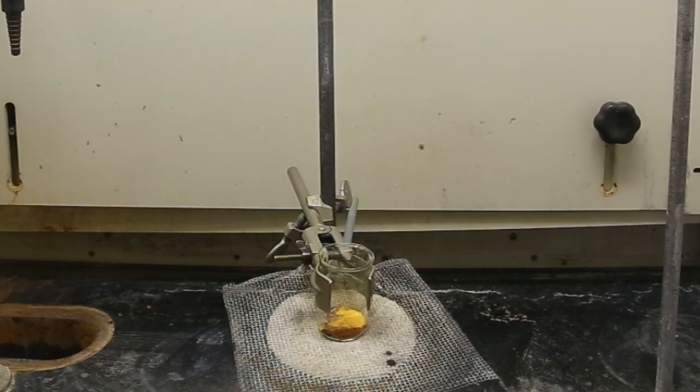The final melting point of my product was still a bit low at about 137 degrees Celsius, which indicates that there is still a significant amount of impurities present. After attempting to complete the polymerization several times, I found that there are several factors that really affect the outcome of the reaction. I didn't have much P-Nitroaniline to play around with, but I did two main runs, one with a little bit of sulfuric acid and one with quite a bit more.